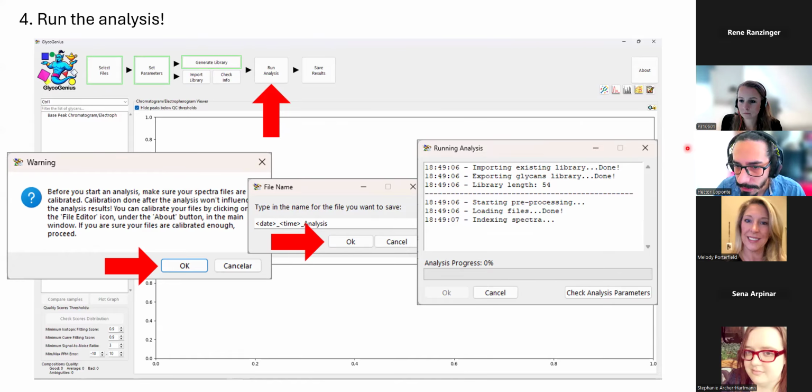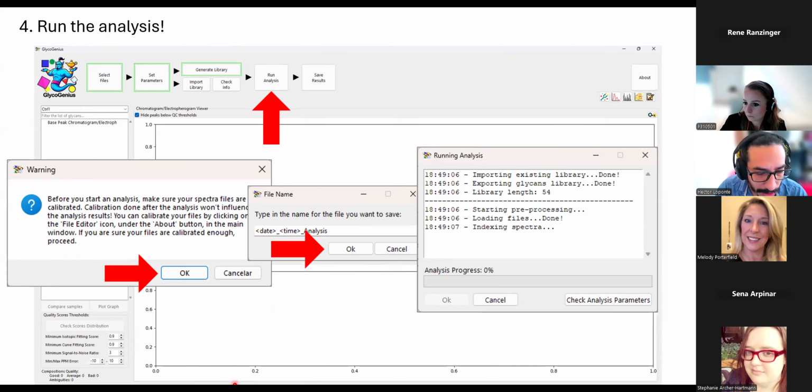Okay. So during this 5 to 10 minutes, I was talking to Guinevere. One of the things that I can show is how you can find out what's the retention time that you want to analyze. So if you allow me, I can also show you in the meantime. This is also provided at the end of the written material as an optional workflow if they want to do it themselves. So let me show you. I will share another window. And please tell me when you are done with the analysis so that we can also move on.